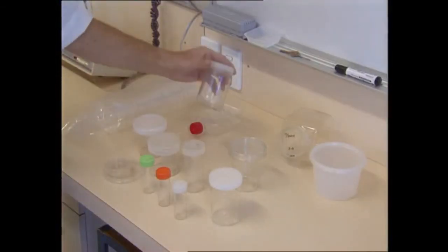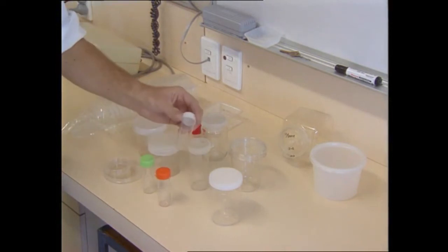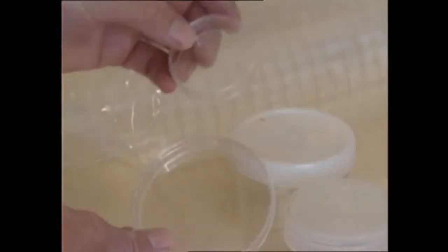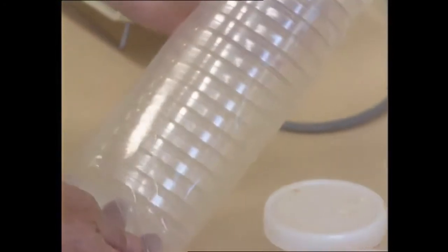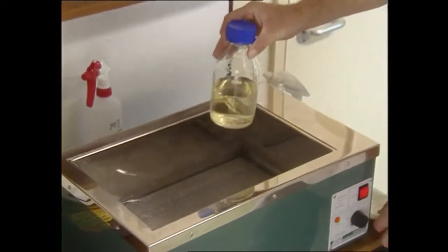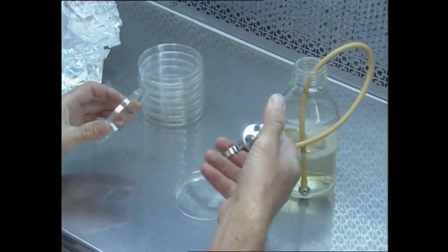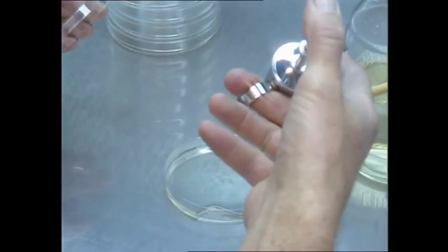There are a wide range of culture vessels: the glass jars, the plastic ones which are autoclavable, and the plastic ones which are not autoclavable and can be purchased in sterile packs. These have been sterilized using radiation. For these ones, media is bulk autoclaved, and then the correct quantity is dispensed into them under sterile conditions.